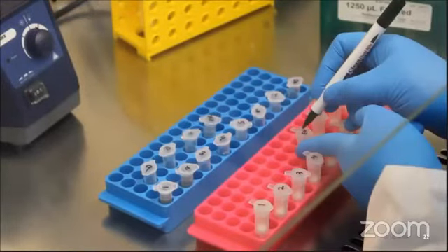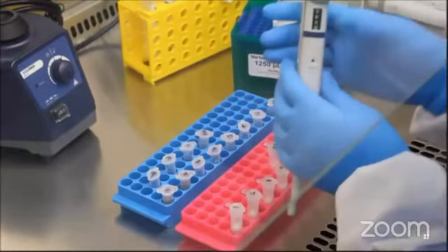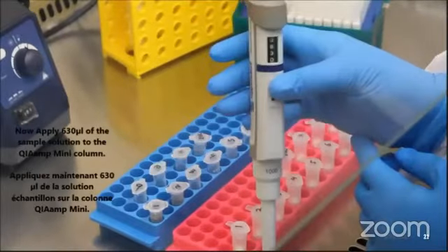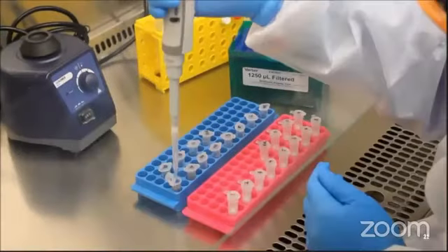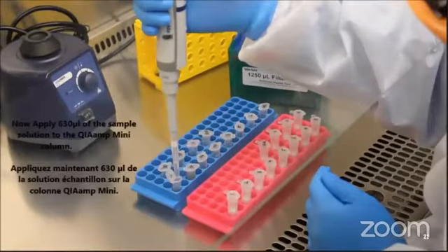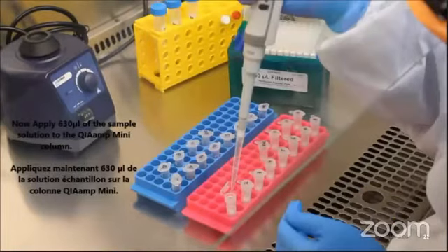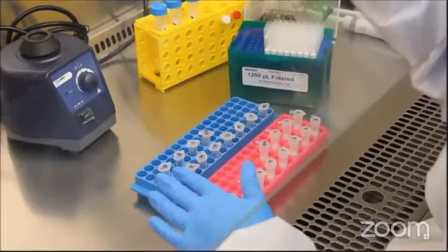After labeling, we have to add 630 microliter of the sample solution containing AVL, carrier RNA, internal control, sample, and ethanol into the silica-based membrane column without wetting the rim.